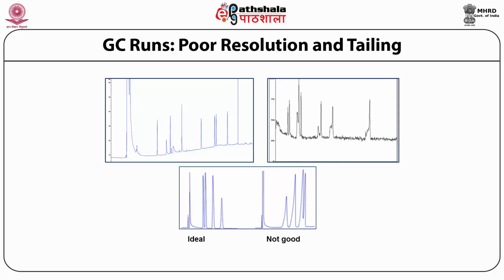A, because of the noise, of course. B, because the smaller peaks will not be able to be resolved. And thirdly, of course, as you can see, there are many peaks that are merging into each other that are also tailing, so the resolution is also quite poor.